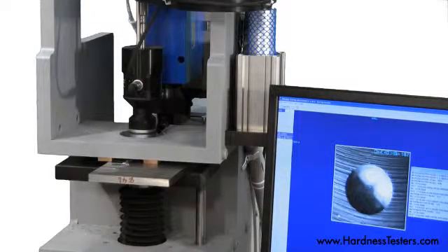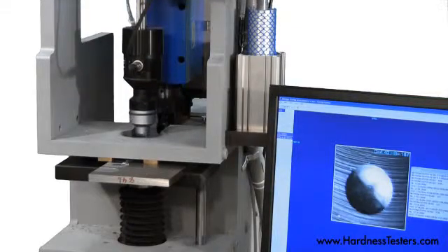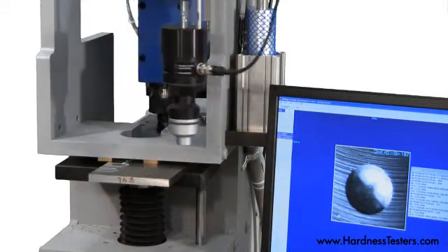The image is displayed on the monitor using the BOSS proprietary software. The hardness value is stored for statistical purposes.